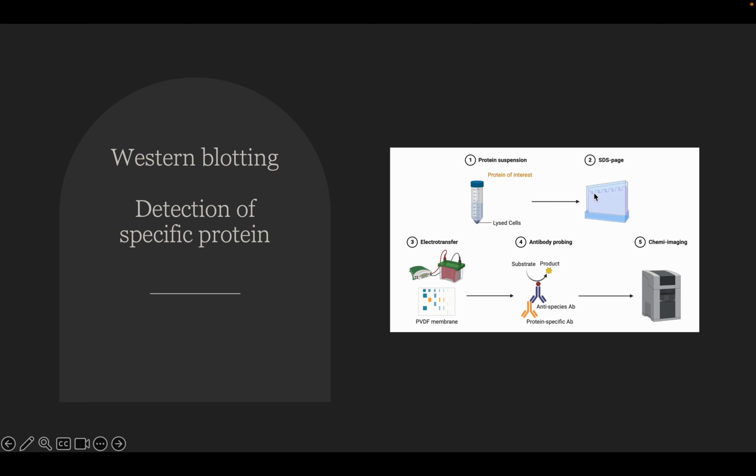First you have the stacking gel, and in this stacking gel there is nothing resolved. The stacking gel is just to bring all the proteins to one layer, so that after this point, they will only move based on their molecular weight. As you can see, just below these wells, the wells included, is the stacking gel, and after this is the resolving gel. And in this resolving gel, the proteins will move only based on their molecular weight.